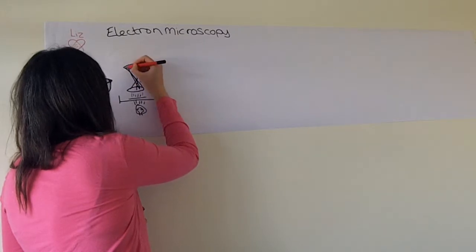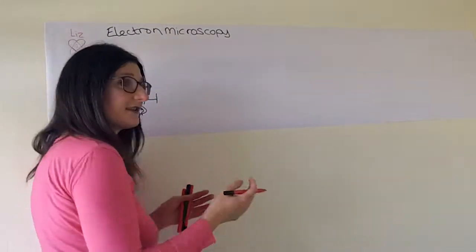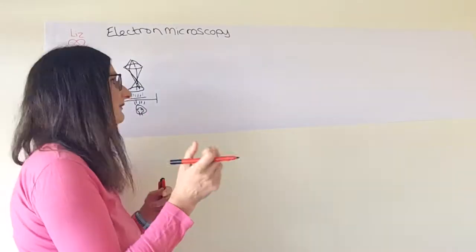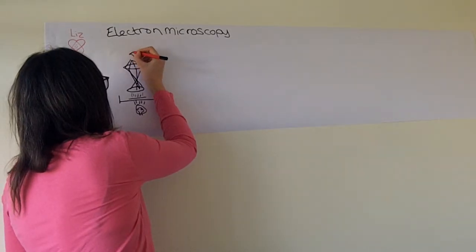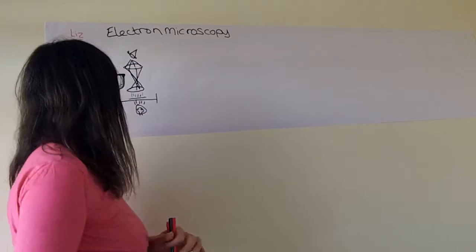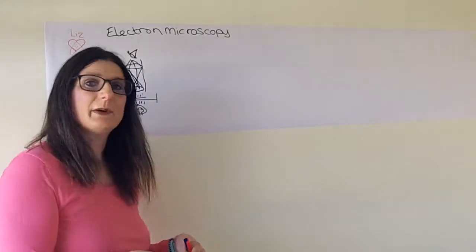And then here we've got another lens, and that's just below the eyepiece because it needs some space to focus it. Same as your glasses, focus your light on the back of your eyes, so you've got that focus space in front of your lens. And this is our eyepiece, and there's our eye looking at it. Let's give it some eyelashes. There we go, and that is our light microscope, and that's all in a dark tube so that you've not got light coming from outside to interfere.